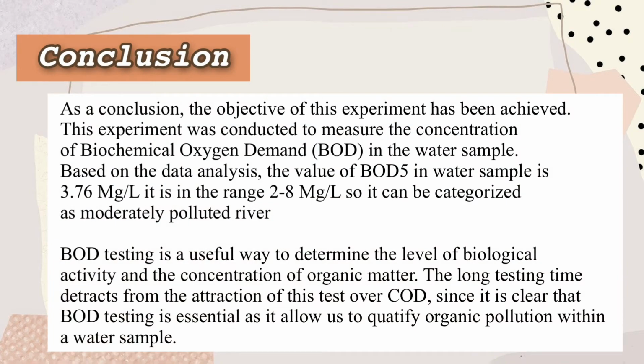As a conclusion, the objectives of the experiment have been achieved. Based on the data analysis, the value of BOD in the water sample is 3.76 mg per liter, and it can be categorized as a moderately polluted river.